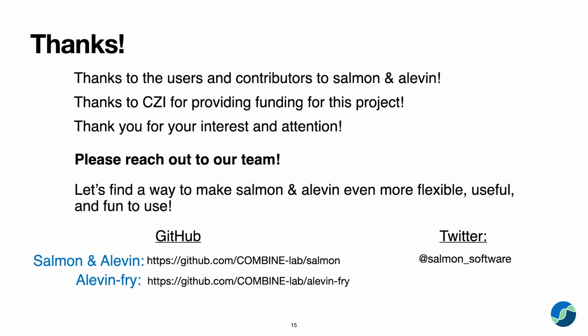My question, and please forgive me if I missed this bit: can you comment a little bit on how Salmon integrates with the rest of the computational ecosystem for processing single-cell RNA-seq data?